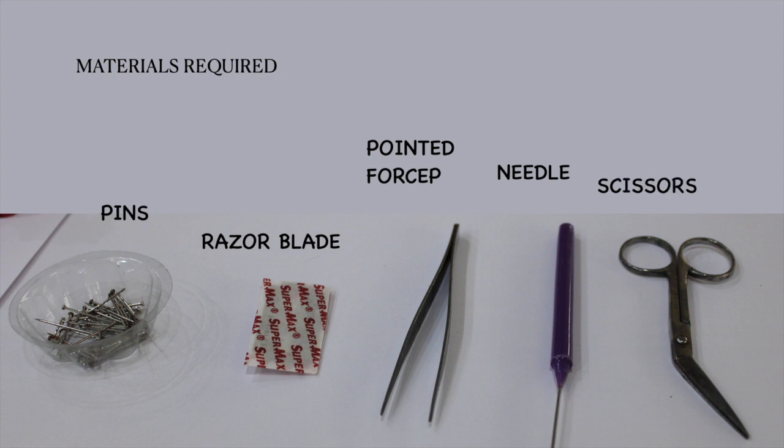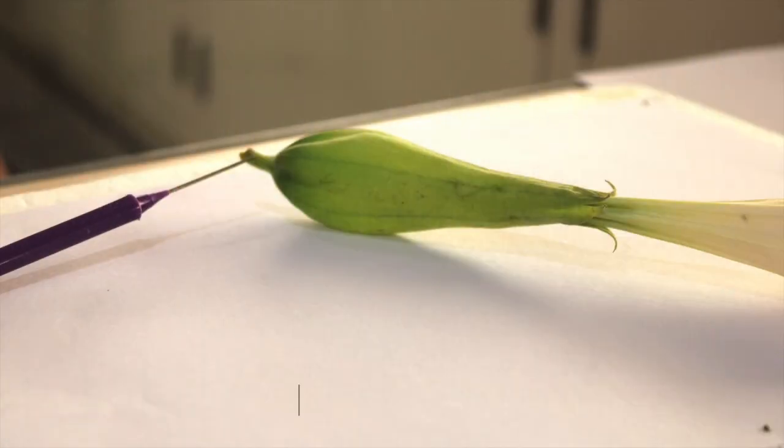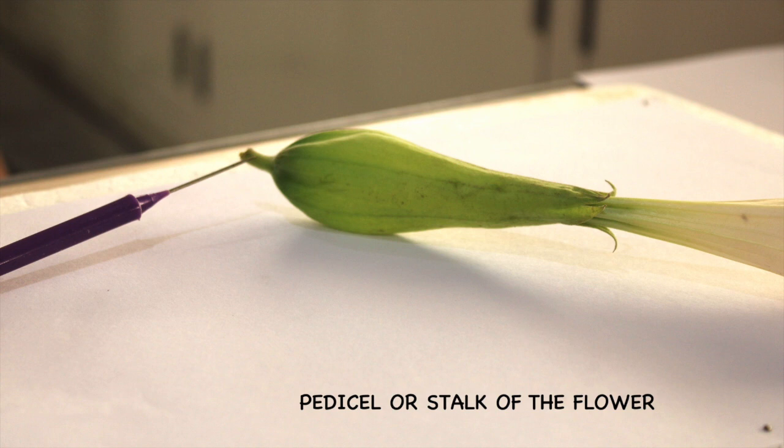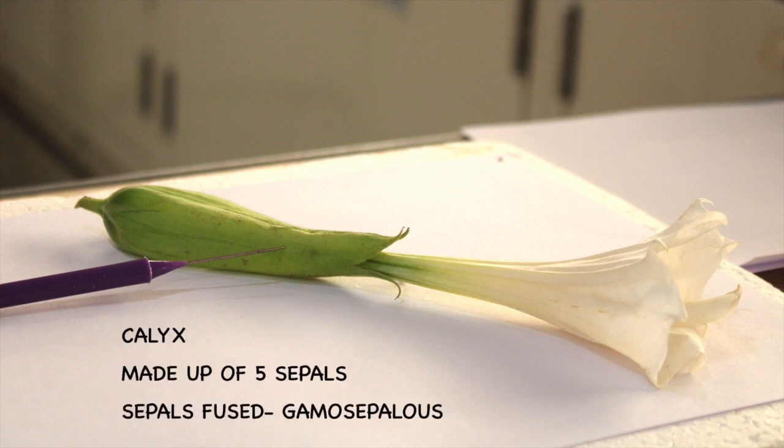Before we begin with the dissection, let us have a look at the terms related to the flower and its parts. Datura shows the presence of a stalk or pedicel, hence is called pedicillate. The calyx is made up of five sepals which are fused, hence called gamosepalous.